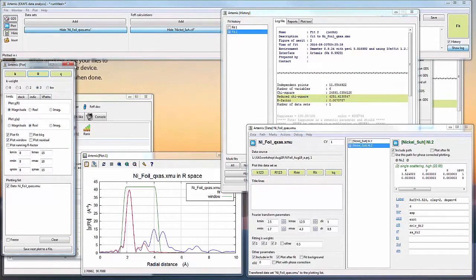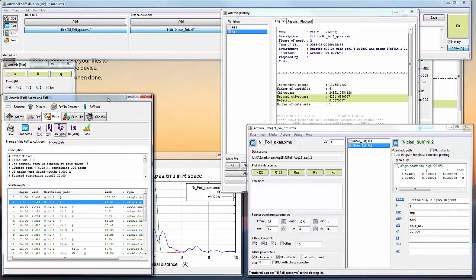So our next scattering path should be around 4 plus the phase shift. So 4 plus 0.3 is around 4.3, and that's where we see our next shell coming in with a high rank, and it's a single scattering path. So the paths that generally contribute most to the EXAFS are single scattering. Multiple scattering, especially in highly crystalline samples, play significant roles as well. Here I'm just going to focus on this next path, which will be a single scattering path.